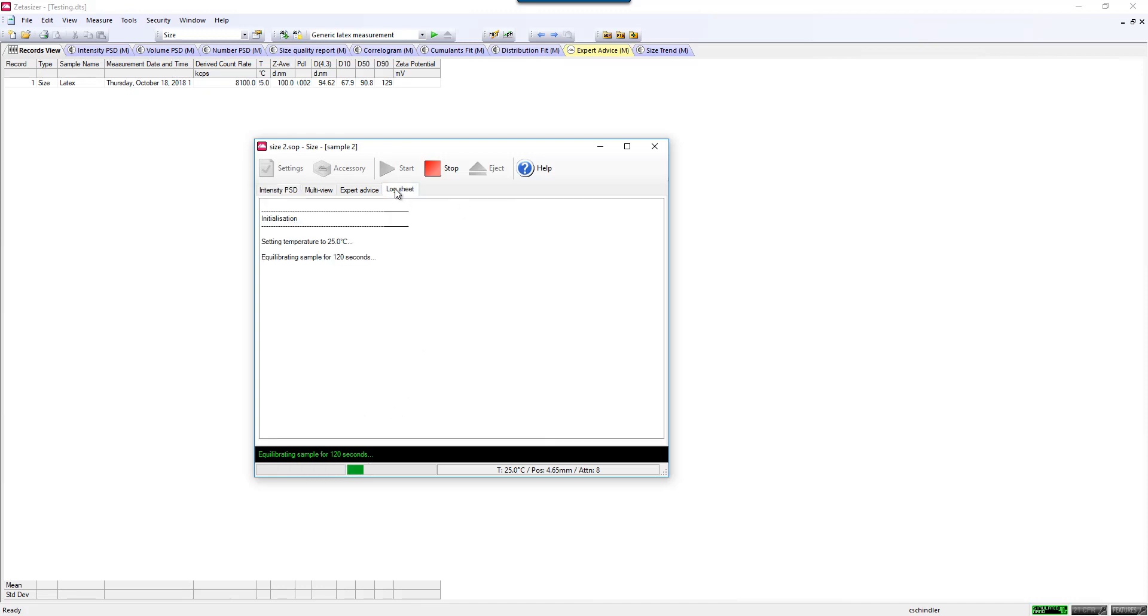If you go to the log sheet, you can follow this as well. You can see some of the optimization processes that go on during the course of the measurement. You can see how the instrument is adapting to your sample based on the count rate that it sees to get optimal data quality and the best statistics for your sample.